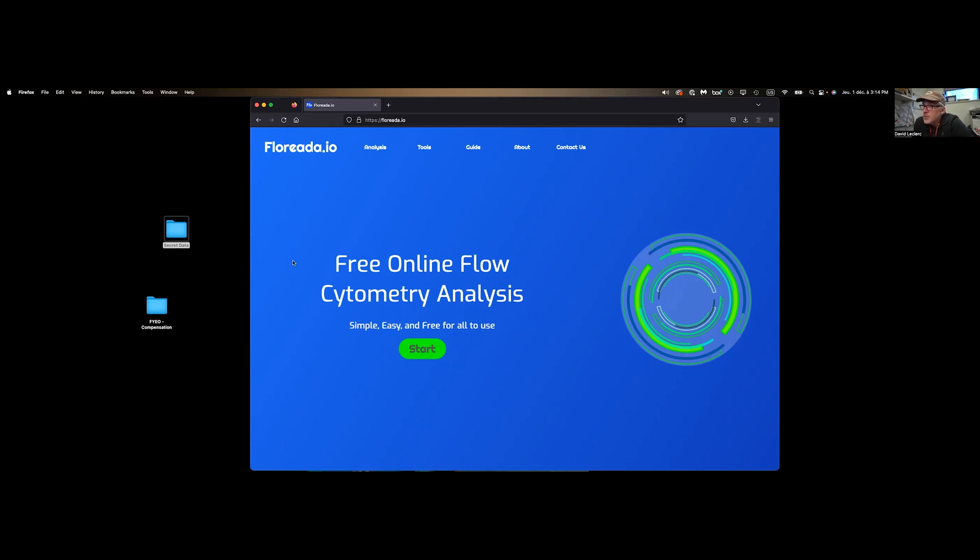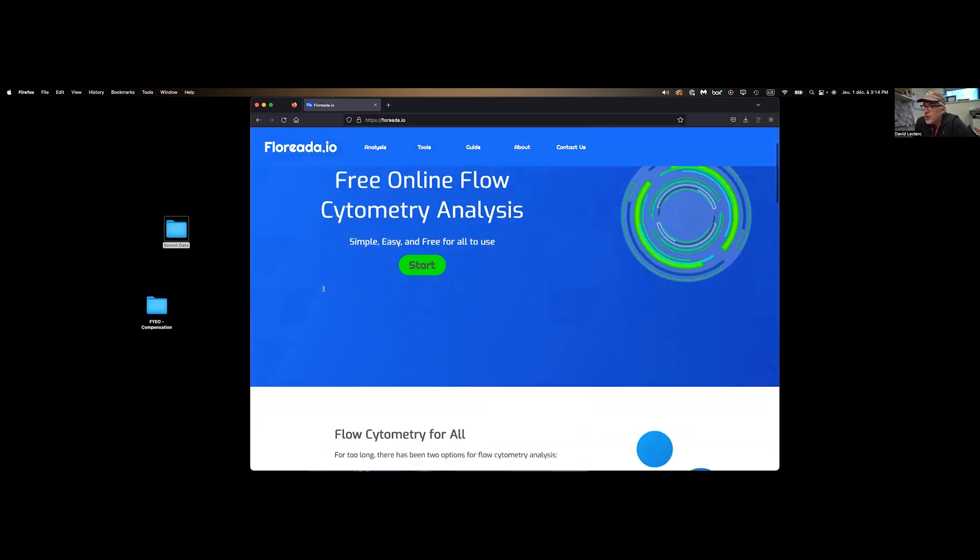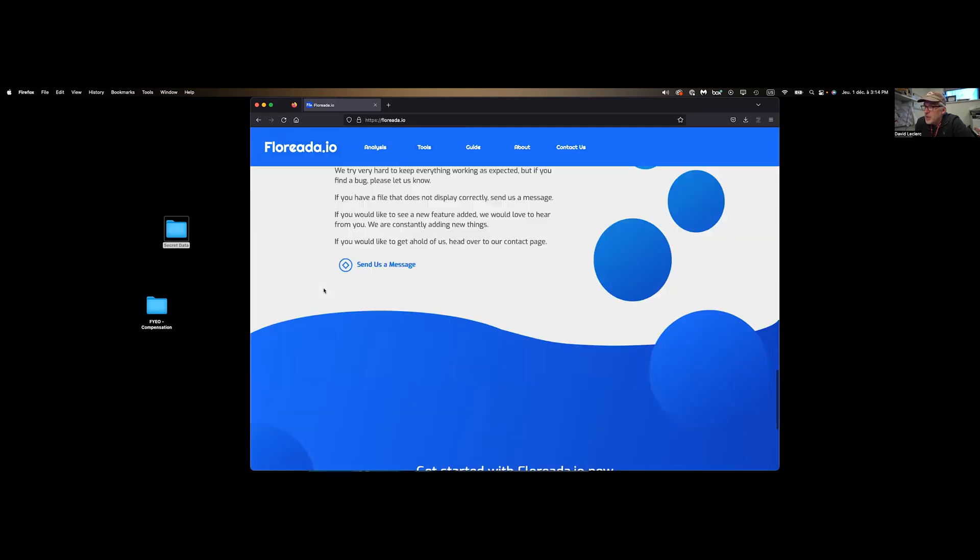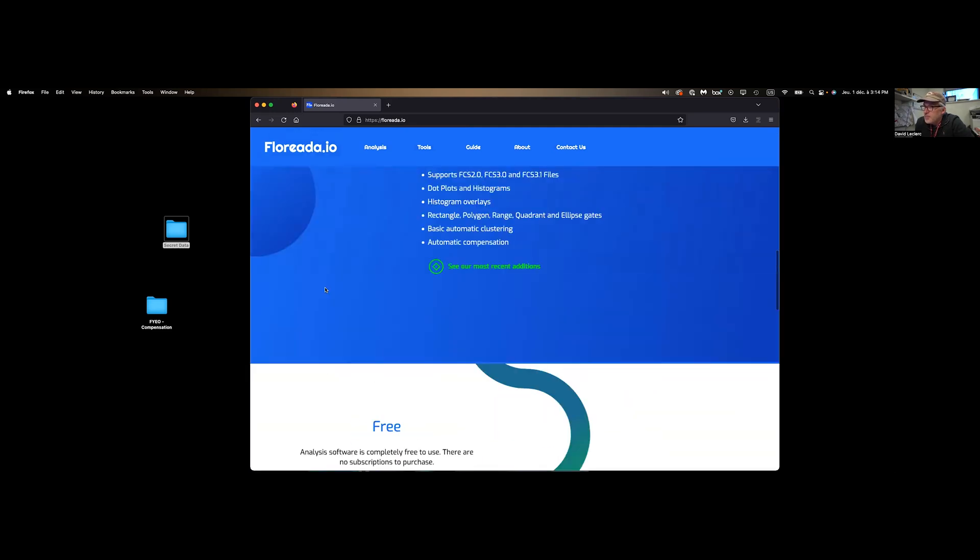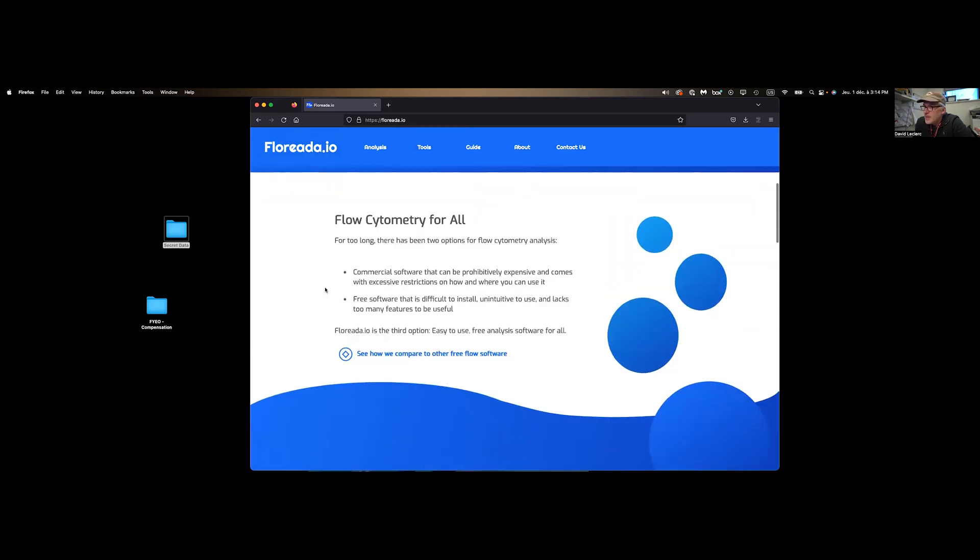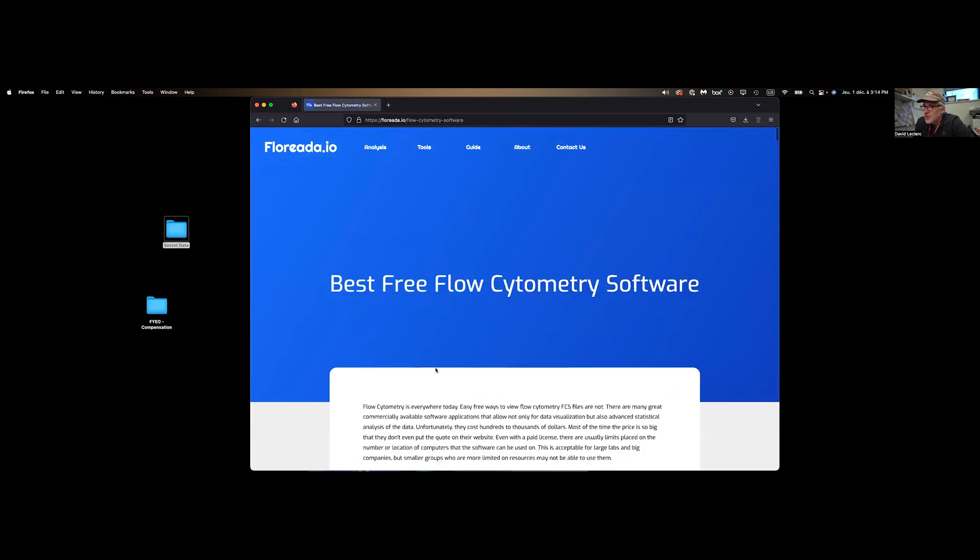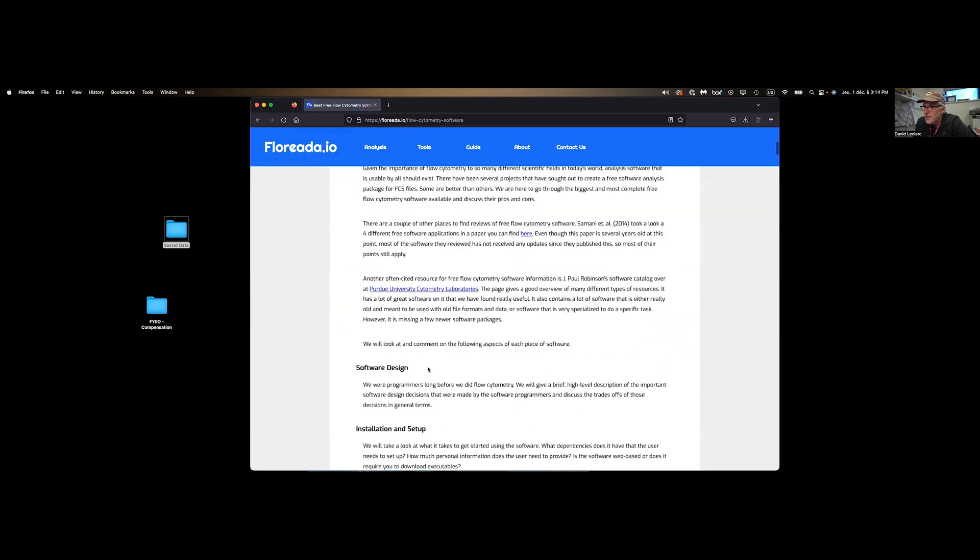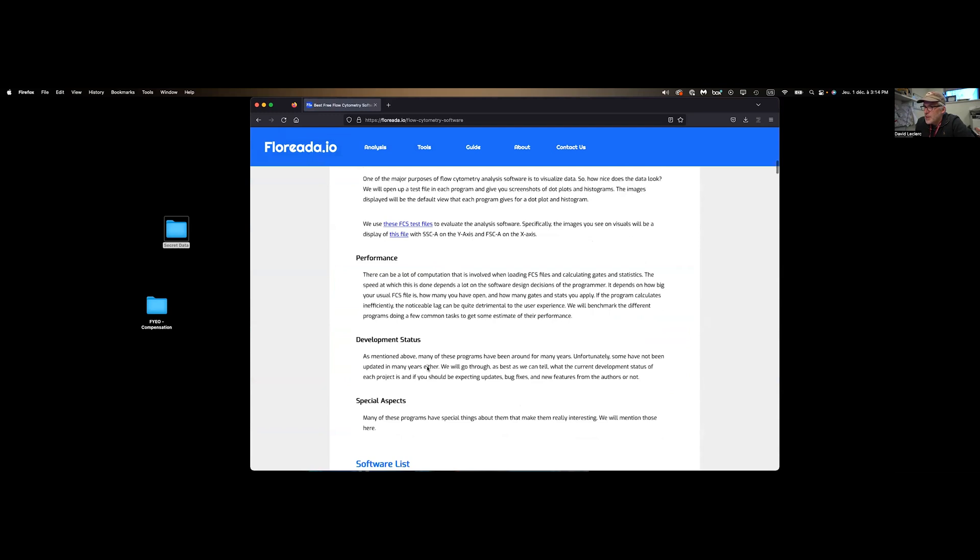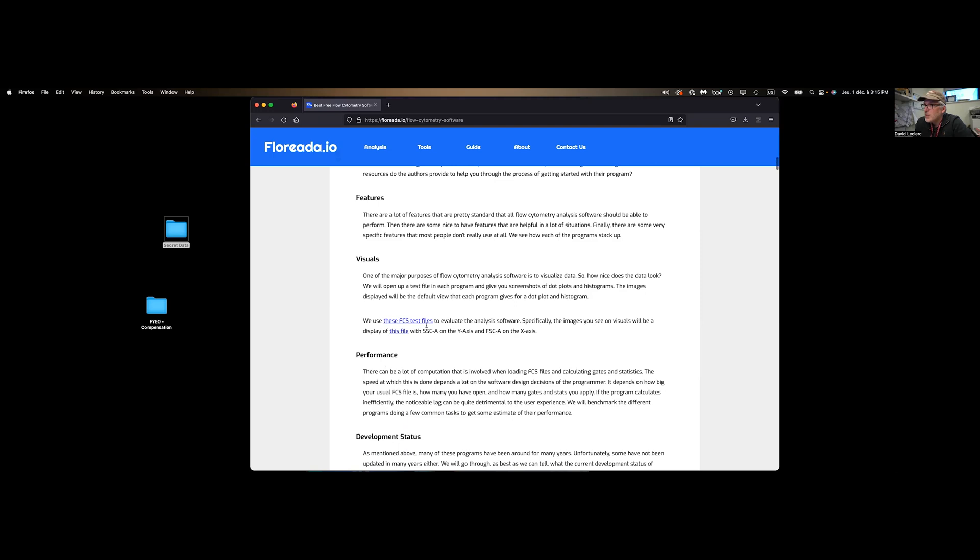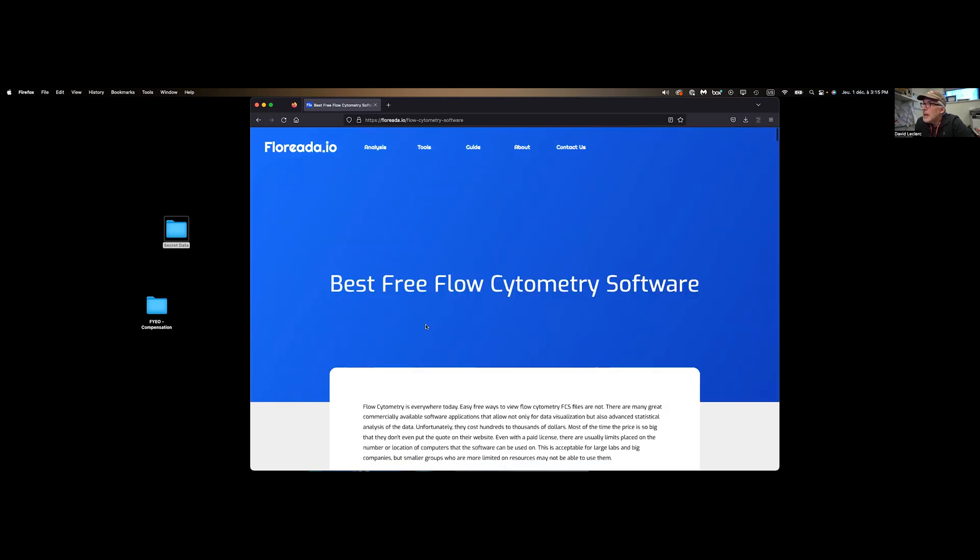This is what you get when you open the software. There's a bunch of information about the group. There's actually a nice review of a bunch of freewares available. If you have a look at their comments about all these different platforms, I pretty much agree with everything that they say. I used to utilize WinMDI at the beginning of my career, so that's painful memories.